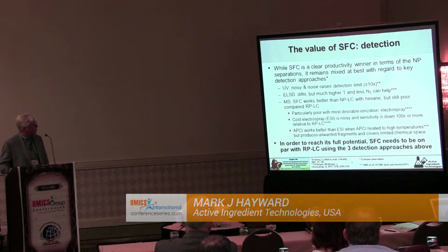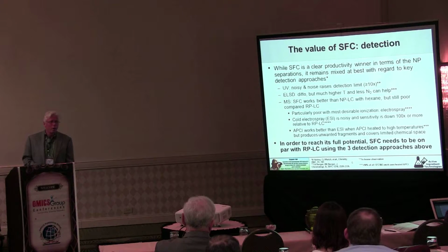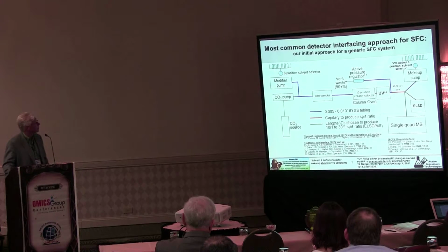Ultimately, in the end, we need to get to do the work that we need to do. We need to get all three of these detectors working close, or maybe as well or better than they do with HPLC. So this is the story of how we got there.